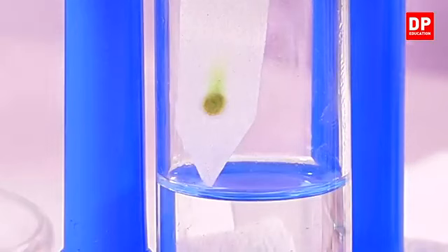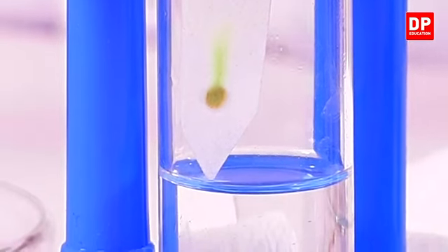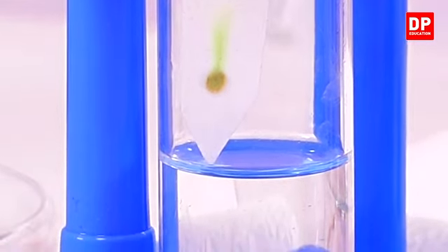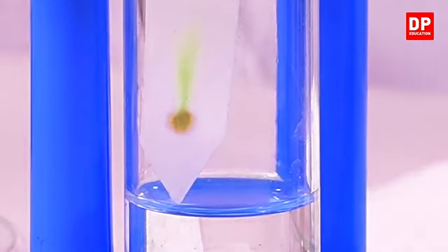You can see the green color moving upwards. So the pigments that are present in the extract are getting separated. Observe clearly, students. You can see the movement of the green color pigments along with the solvent.